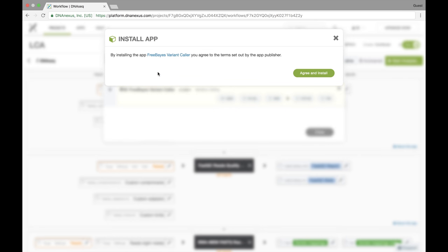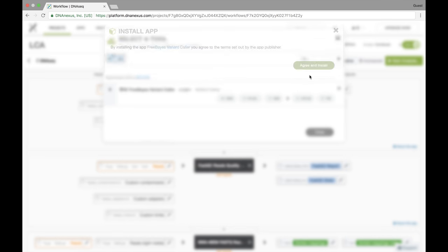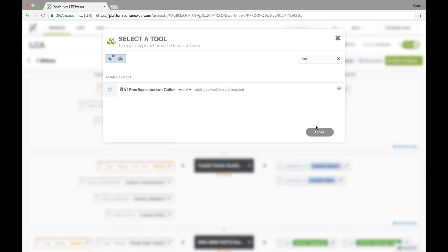And then we'll end with FreeBayes for our variant calling. And again I'm giving the prompt since this is the first time I'm running FreeBayes. I agree and install. Alright so now we've added all the steps to our workflow.